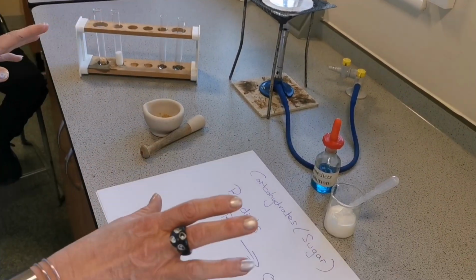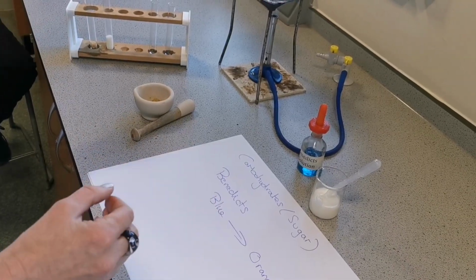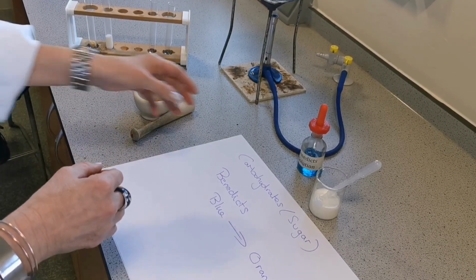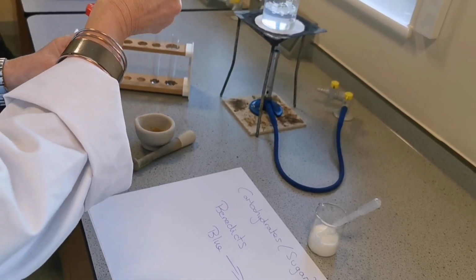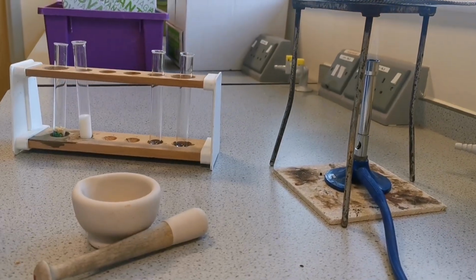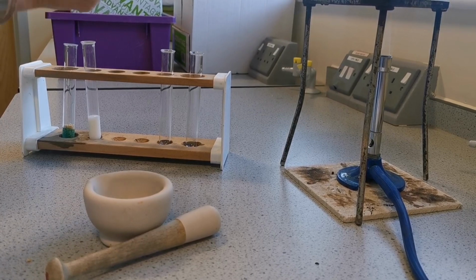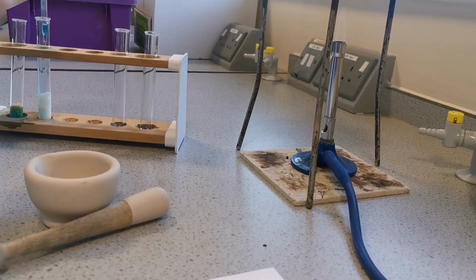So maybe you want to pause the video here and have a little guess, set yourself a hypothesis, which is an idea to test, as to which one you think is going to have the most sugar in. So what we need to do is add a few drops of Benedict's to each of these. So I'm going to use 2 droppers full, and the same in the milk.